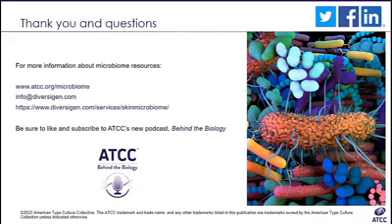I would say that blank controls need to be added to your skin microbiome pipeline because, again, skin is a low biomass sample. And as we showed in the webinar, skin samples are more prone to contamination compared to other samples. If your blank control shows any signs of contamination, especially those related to your sample of interest, for example, if your blank control is showing skin bacteria, then you know that there are issues that need to be addressed. So for example, here at Diversigen, we always add a blank control from the moment the samples are extracted just to make sure that there is no background contamination from the reagents, for example, or any cross-contamination.